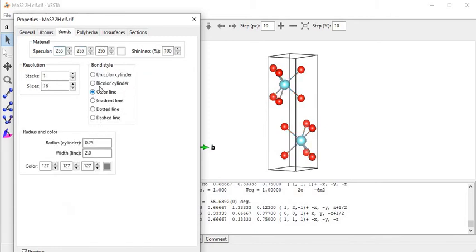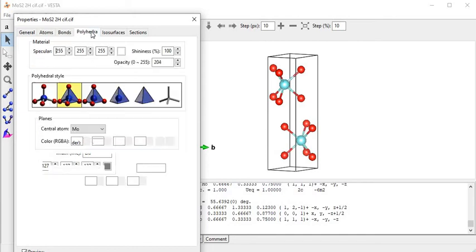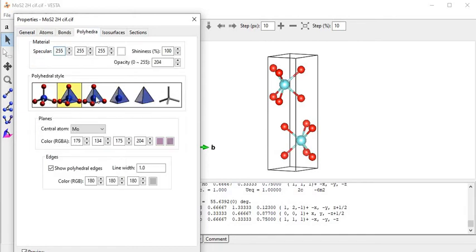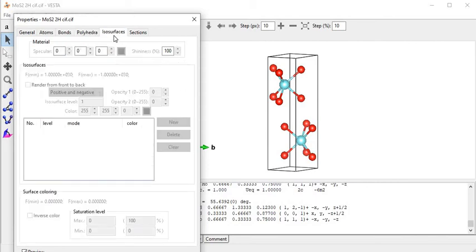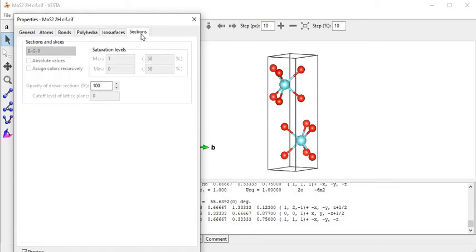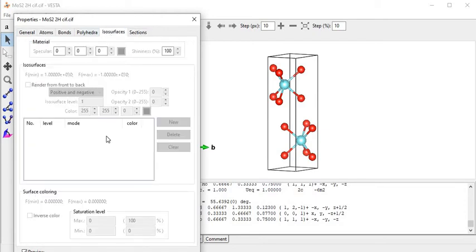In the bonds section there are different bond color, line style, and other settings we can tune by clicking - dash line or dot line. This is a very basic part. In the polyhedral section there are different style types showing different types of polyhedral appearance. There is also an interface selection option, though I don't know that part very clearly.